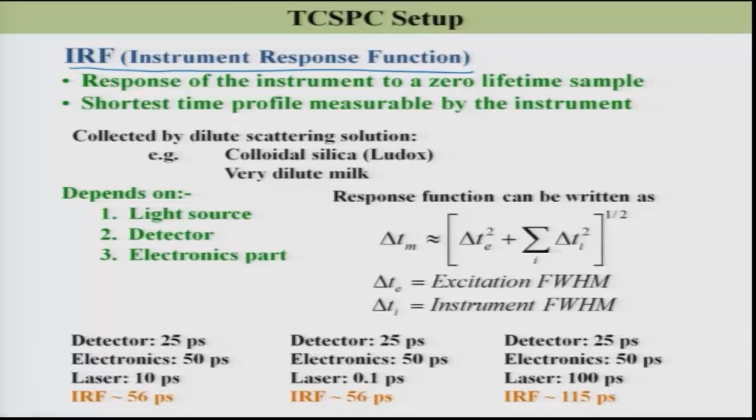So, taking all these time error components in the TCSPC setup, I am going to get a collective response of the instrument, which is called the instrument response function.